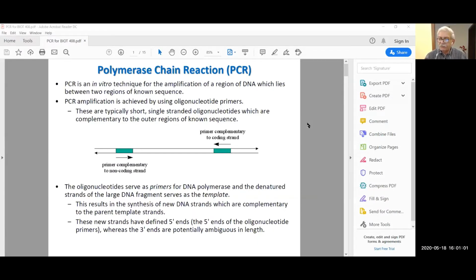In case of PCR, we know that we are performing PCR amplifications, and this amplification is desired for a particular gene of our interest. It may not always be a gene, but some other time it may be some promoter, some other regulatory sequence, or some terminator. There may be several different desires, but the technology is the same. And we need a template for that purpose.